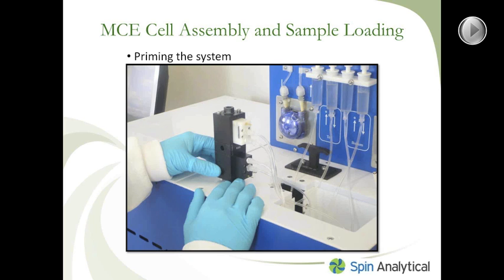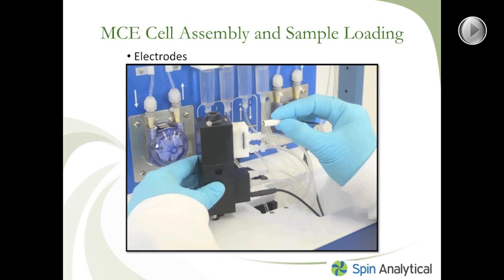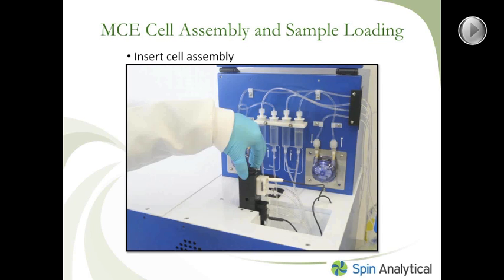Here is what it looks like when you hook up your electrodes. The electrodes are color coded: the white electrode goes to the white buffer chamber, which is the top buffer chamber, while the black electrode goes to the bottom buffer chamber, the black buffer chamber. Once everything is hooked up — including the tubing and the electrodes — you can place the entire assembled cell assembly into the MCE instrument, making sure that you push it all the way down into the machine.